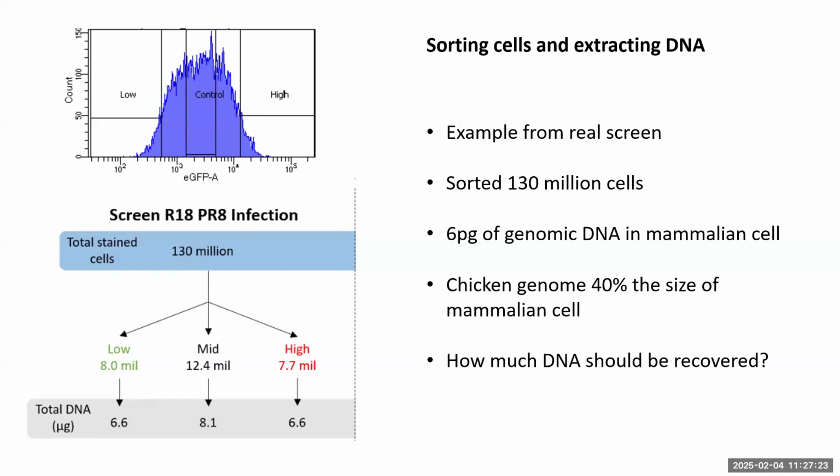The next question, and this is a bonus one, hard maths, definitely comes with a Tunnock's tea cake. What is the equivalent coverage we're getting from 6.6 micrograms, given that each genome should carry one guide?